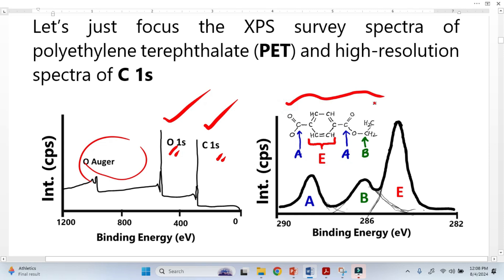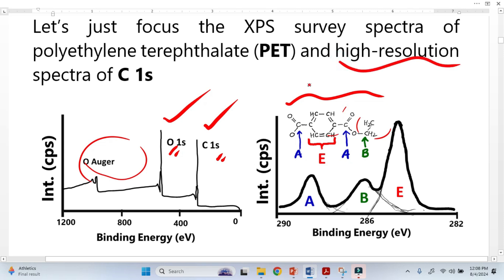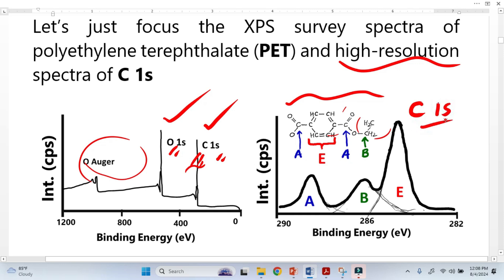Now look at this formula. Carbon has different chemical environments — in one case we have different types of neighboring elements, in another case we have different types of elements. This kind of information we can get from high resolution spectra. We focus on the most important peak from the survey spectra: the Carbon 1s peak. When we examine it, this peak is basically composed of three different peaks.